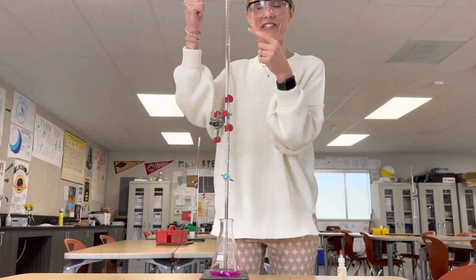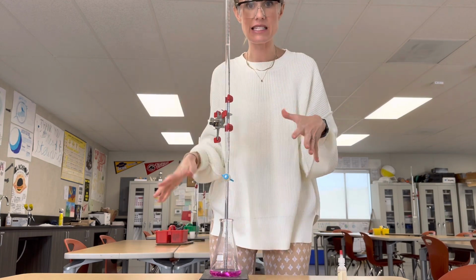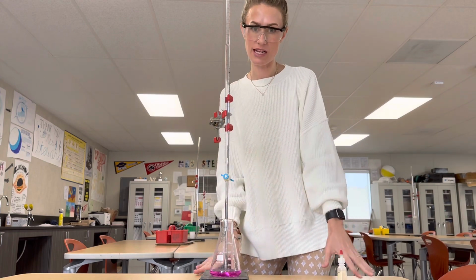You want to use the difference in those two volumes, so the initial volume and the final volume, whatever that difference is, is the volume of the base that you actually used. So that's going to be the one that you use in your neutralization calculation.